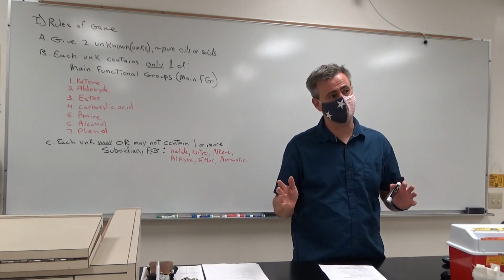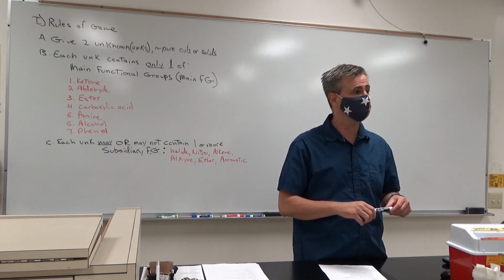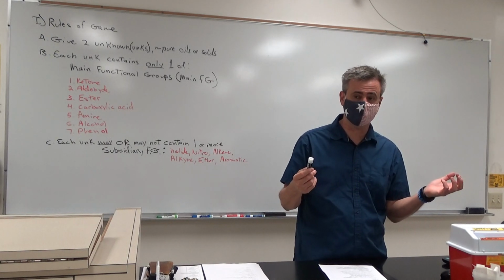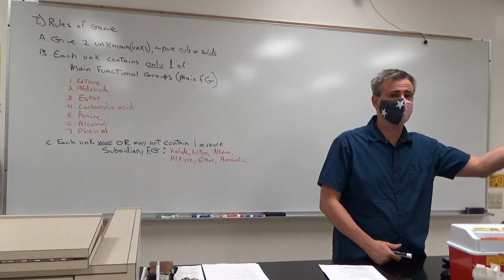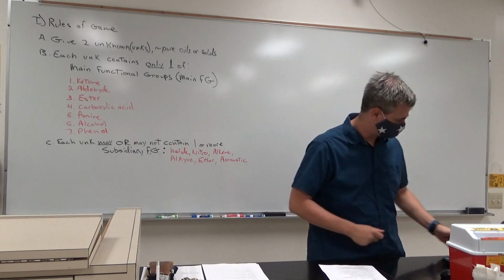Anything around 0.9 ppm that integrates for 3 is probably a methyl group. If I had a triplet near 0.9 that integrated for 3, that's probably a methyl group that has a CH2 as a neighbor. Make sense?